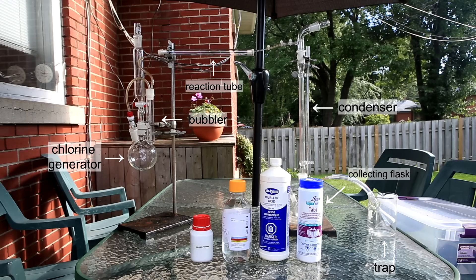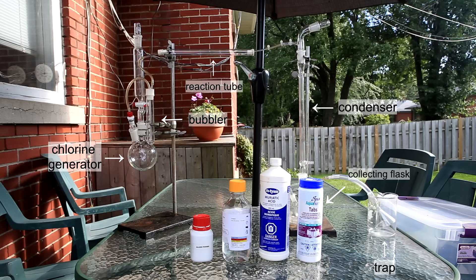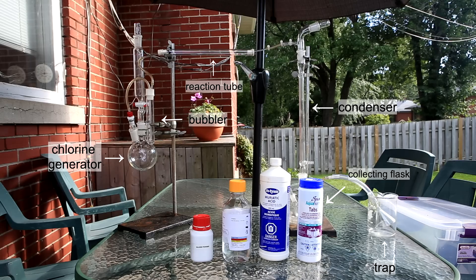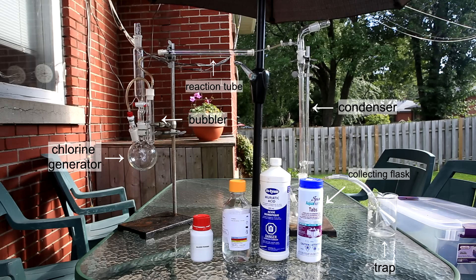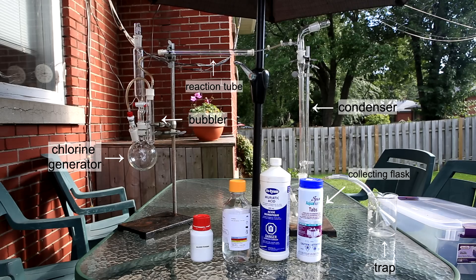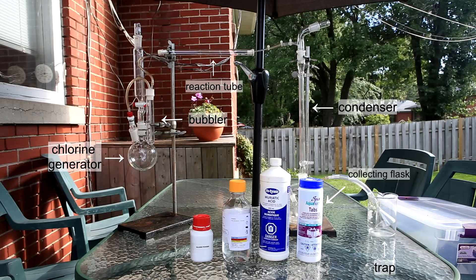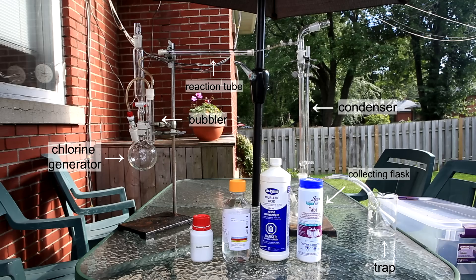On the left we have our chlorine generator with gas bubbler; on the right we have a condenser column with our collection flask hidden behind the pool tablets; and in between connecting the two we have a reaction tube. Chlorine is generated on the left side, goes through the bubbler to dry it, and then passes over hot silicon in the reaction tube. This produces silicon tetrachloride vapors which travel to the cooling column and are recondensed into liquid form. On the far right there's a trap with dilute sodium hydroxide to collect any silicon tetrachloride or chlorine that makes it through.